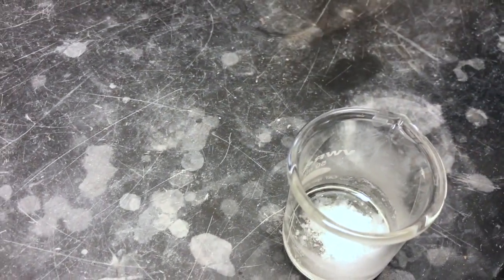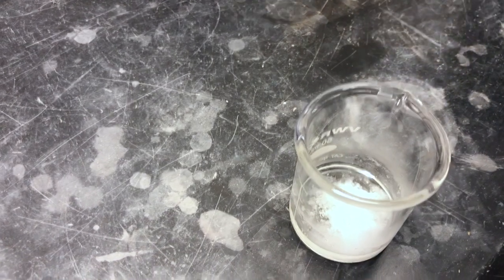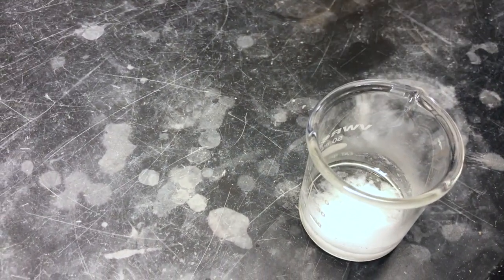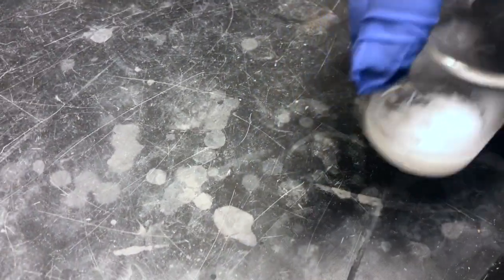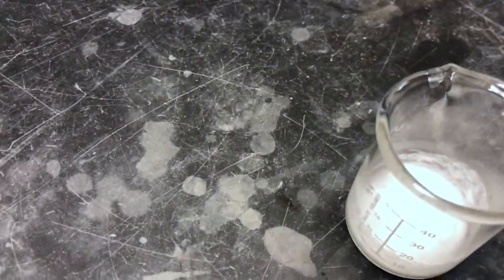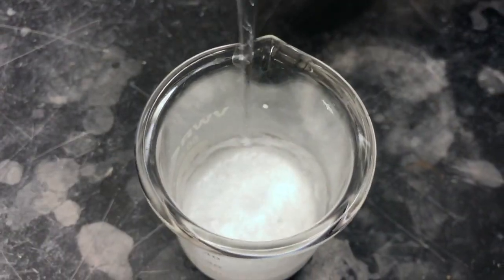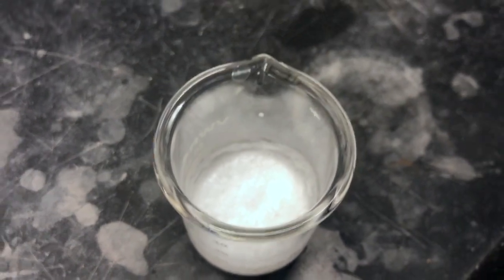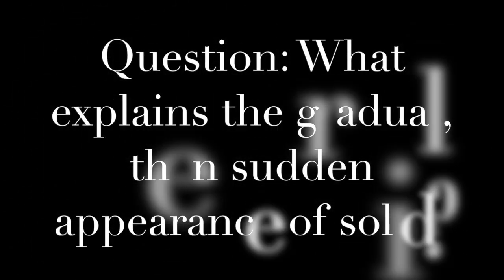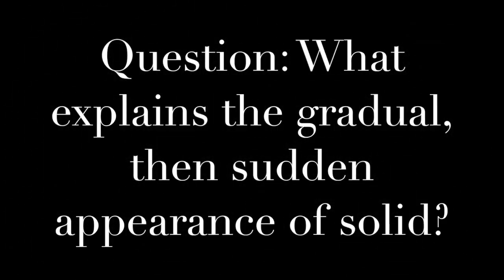So we continue to add more sulfuric acid and as you add more, more precipitate forms. So you know you're not done yet. Looks like it's very cloudy now. Lots of precipitate. One little last drop was added. No apparent additional precipitate forms. So we're finished adding the sulfuric acid at three milliliters exactly.